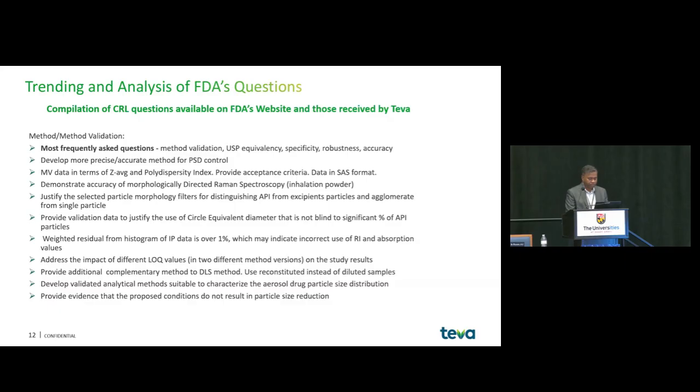Provide acceptance criteria. Data in SAS format. And also demonstrate accuracy of morphologically directed Raman spectroscopy. There's also been questions on justifying the selected particle morphology filters for distinguishing API from excipient particles and agglomerates from single particles.